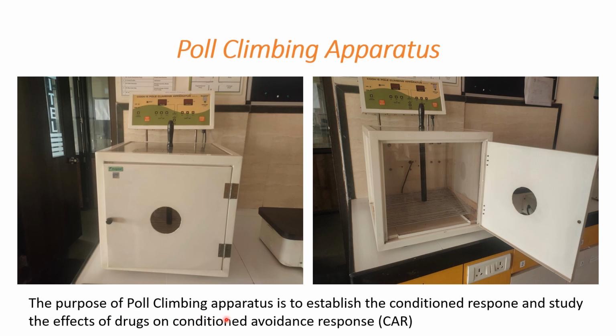The purpose of pole climbing apparatus is to establish the conditioned response and to study the effect of drug on conditioned avoidance response. So this is the pole climbing apparatus. By using this apparatus, we'll study the conditioned avoidance response.